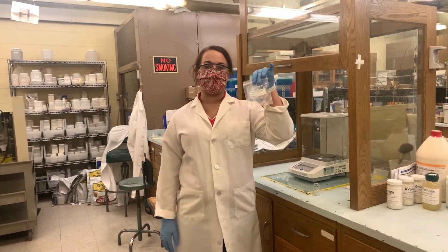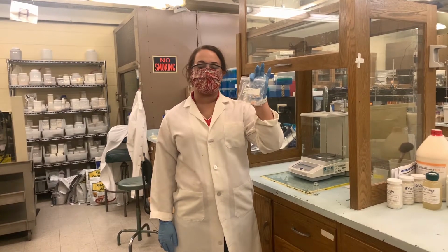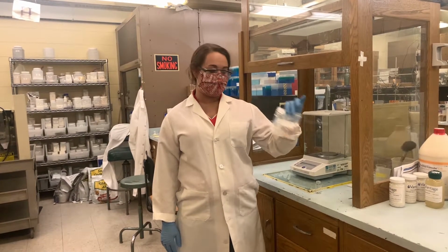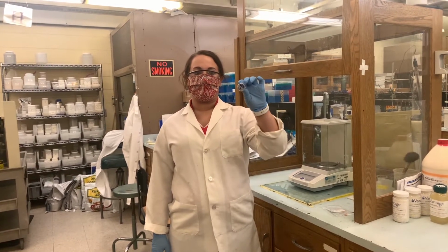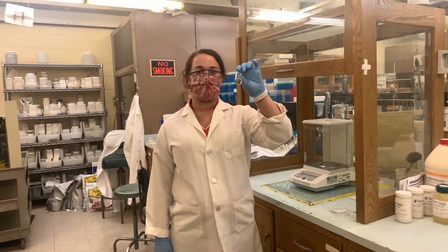To measure the total lipid content within a duck tissue, we start out with a little baggie like this. This is what a grinded up duck oviduct looks like. We weigh out a certain amount of the sample, go through a wet lipid content assay, and in the end, after heating, it ends up looking like this in the vial with little yellow chunks that are the lipid content within the tissue of the oviduct.